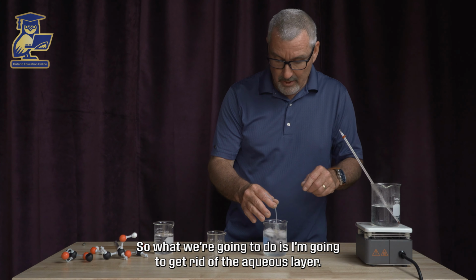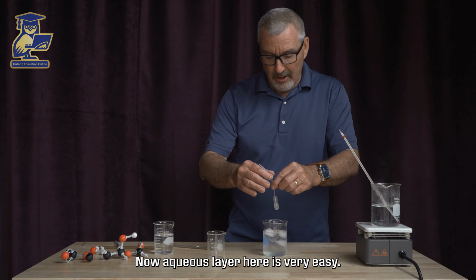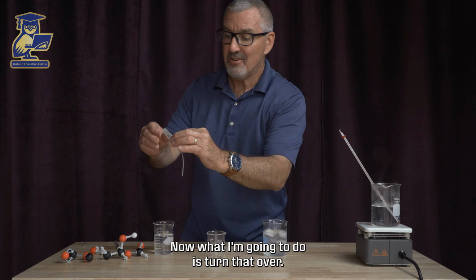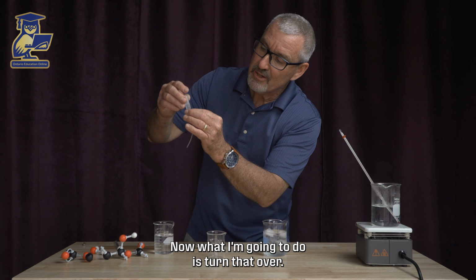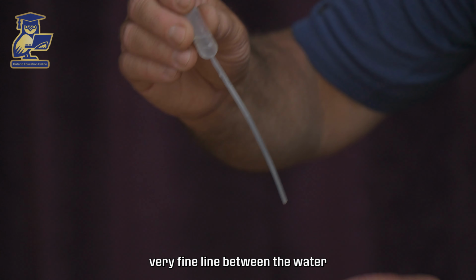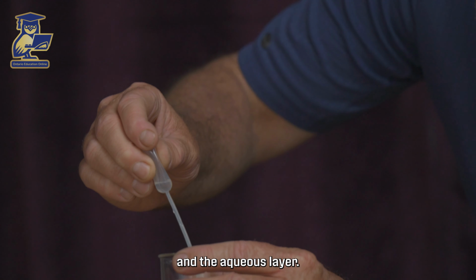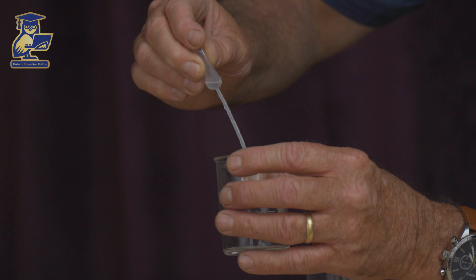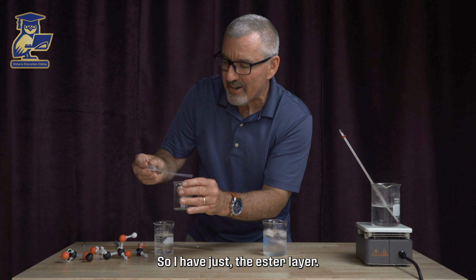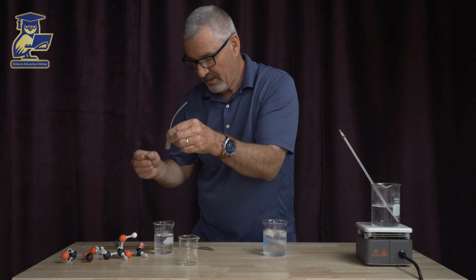So what we're going to do is I'm going to get rid of the aqueous layer. Now, the aqueous layer here is very easy, just a separating funnel now. What I'm going to do is turn that over. And I have a very, very fine line between the ester and the aqueous layer. And there it is. So I have just the ester layer. I didn't make a lot, but it's a qualitative lab.